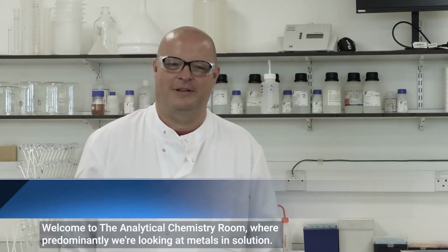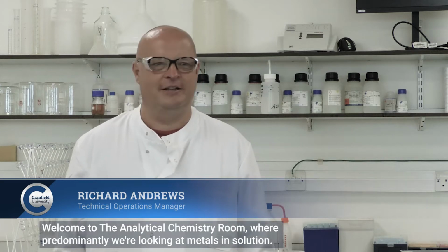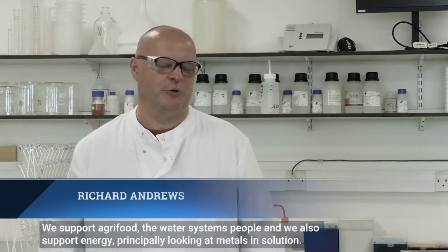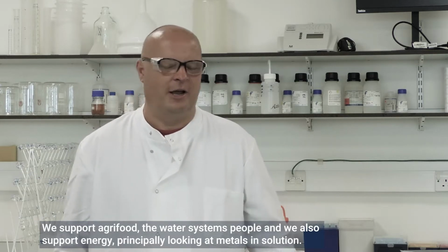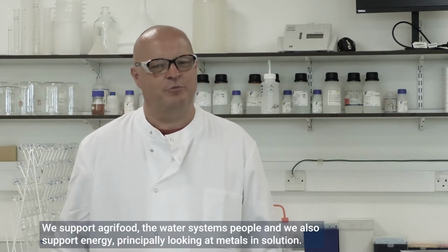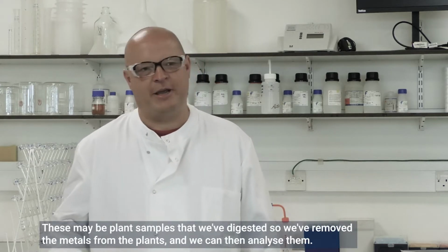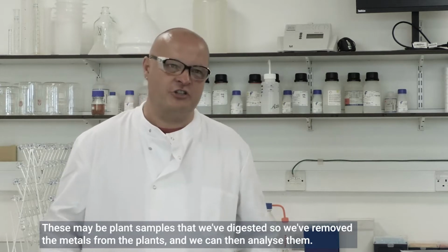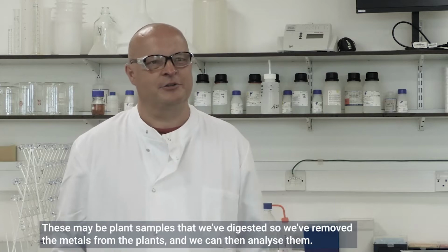Welcome to Analytical Chemistry Room, where predominantly we're looking at metals in solution. We support both agri-food, the water systems people, and also energy. Principally looking at metals in solution, but these may actually be plant samples that we've digested, so we've removed the metals from the plants and we can then analyse them.